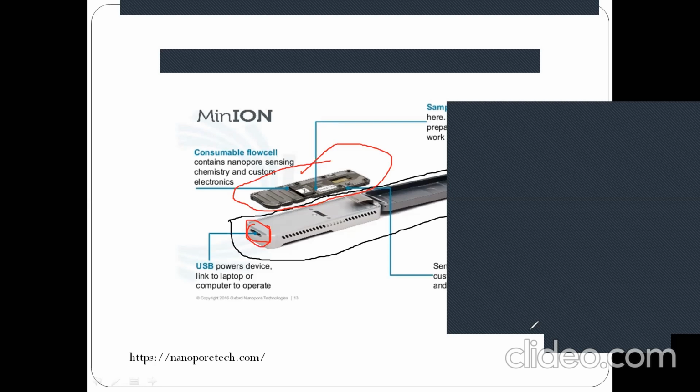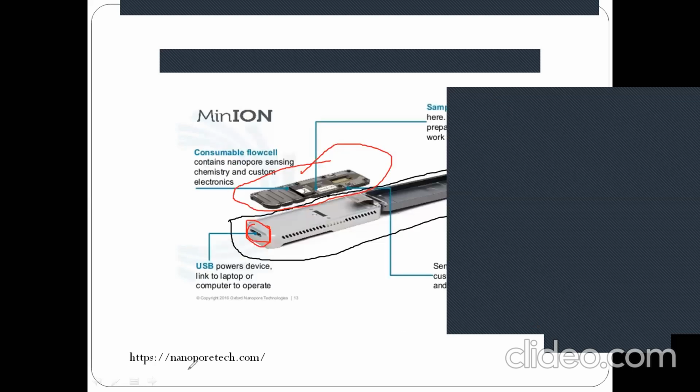The 50% is definitely much cheaper than your PacBio system or your Illumina system. But the question is about the accuracy of PacBio. I'm coming to that, I haven't answered all the queries from your end yet. So that is the first thing, and that's why this system cannot completely replace PacBio or Illumina.